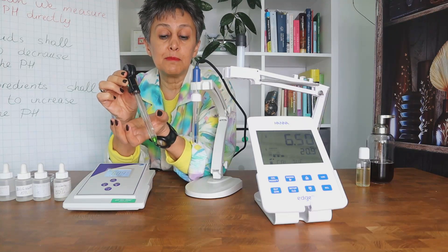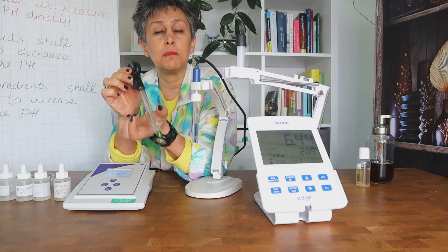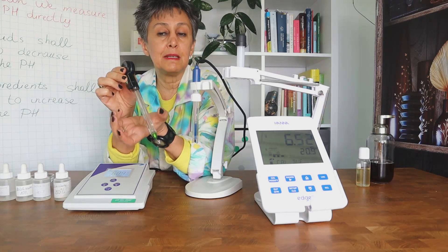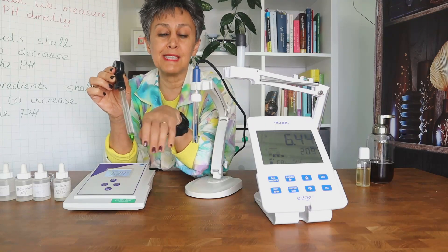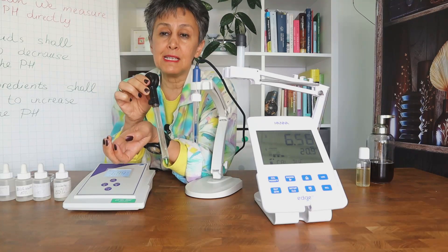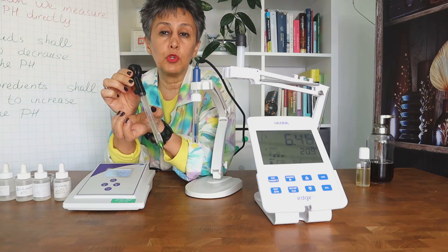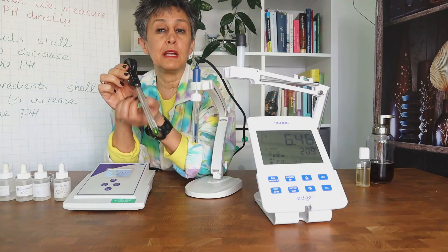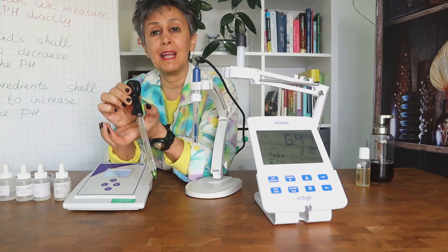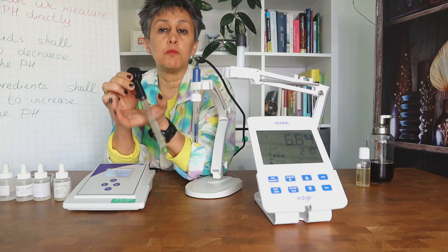Second, you need more time and more chemicals to clean the electrode between each measurement. If you dip the electrode in a diluted cream, it is easily rinsed with distilled water and you can dab it dry and immerse it in the next sample. But if you dip it in a concentrated cream, when you remove the electrode you need a much longer time and a specialty electrode-cleaning solution before you can measure the next sample.